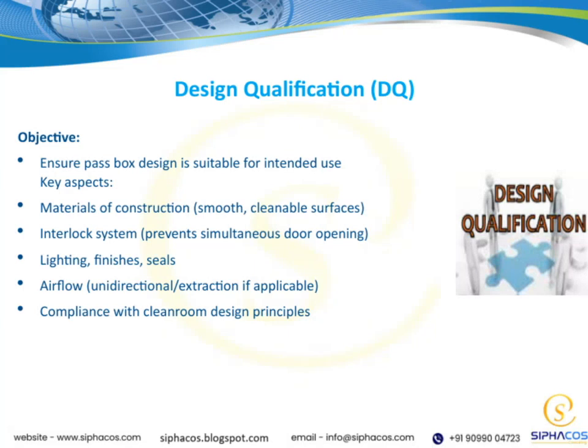Let's talk about design qualification, or DQ, which is a crucial step in ensuring our PassBox design is suitable for its intended use. The main goal here is to verify that the design meets all necessary requirements before we move forward. First, we need to focus on the materials of construction. It's essential that the surfaces are smooth and cleanable, because this helps maintain a sterile environment and prevents contamination.